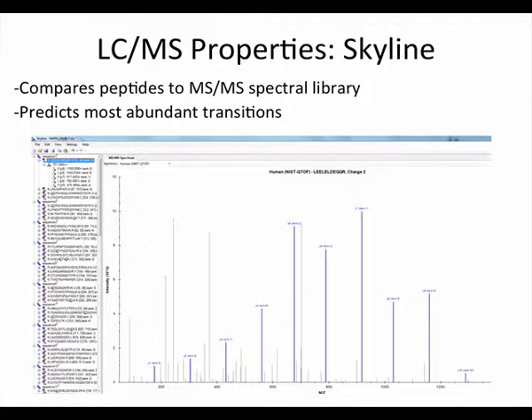I'm just curious. Do you think that kind of software is going to create interference? We have a set of peptides and people tend to use the similar peptides as the standard, so naturally more and more people select those kinds of peptides. Yeah, a lot of this data is actually from discovery proteomics, though. I know what you're saying, but a lot of this stuff is not targeted. So you're using data from non-targeted experiments and making sure that peptide shows up when you don't select for anything and just let everything come through. Because even though you're targeting, you want to make sure somebody has seen it at some point. Otherwise, it's very unlikely that you're ever going to find it. So it's not the only resource, but it's good to check. It's similar to GPMDB in that it's a lot of data from other experiments.